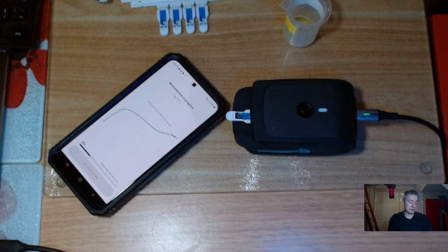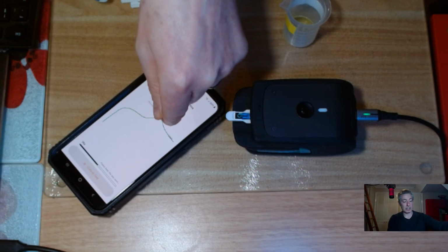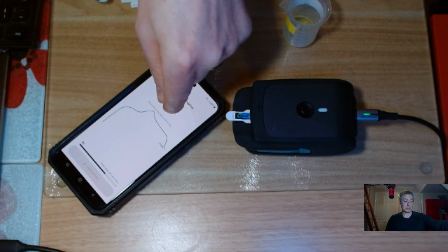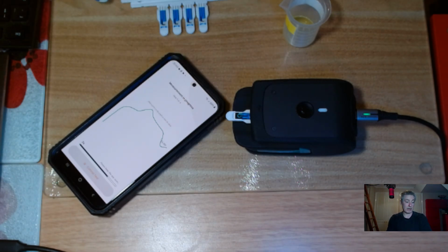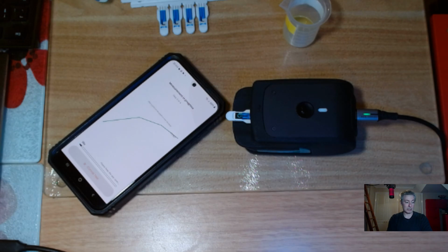One at 50 millivolts, that'll be the slowest one. That's probably the oxidation now of ferrocyanide to ferricyanide, and then it will do the reduction of what was oxidized there, so that will take ferri back to ferrocyanide. So that'll be like experiment number 1, and then it'll do experiment number 2, which is the same experiment, but just at a faster scan rate, probably at like 100 millivolts.